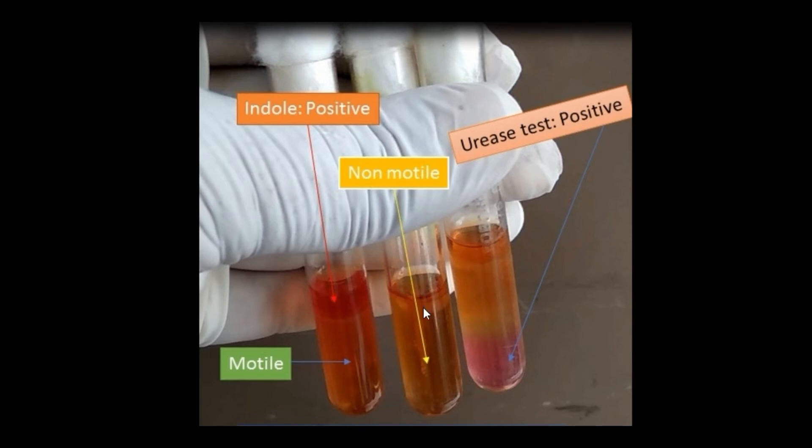Whereas in this tube, absence of red ring means indole negative.